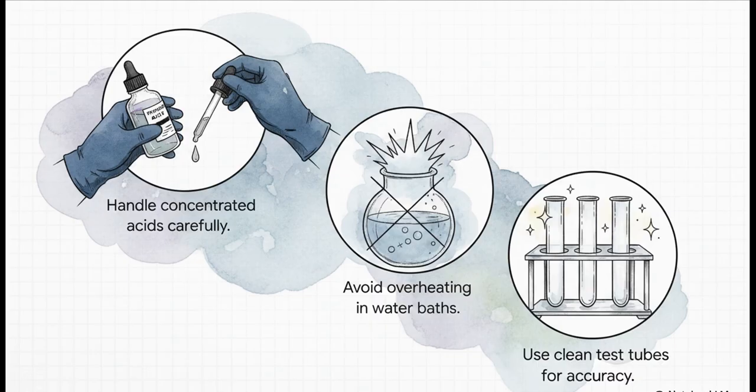Finally, always start with immaculately clean test tubes. Remember, we are relying on subtle visual observations here. If a dirty test tube alters the color of your reaction, your entire investigation is compromised.